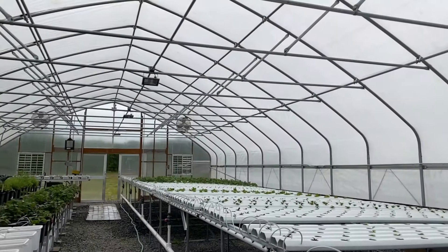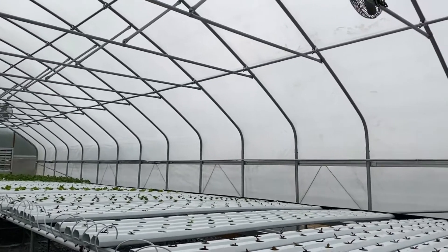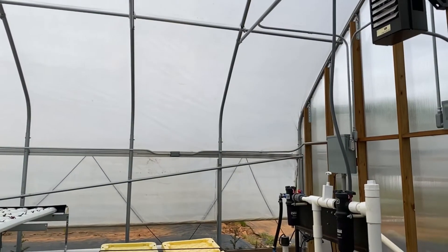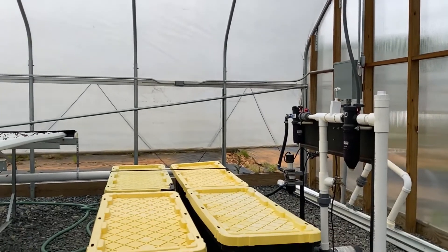This video will go over how to take water quality parameters in a hydroponic system. At Firebird Farm, our nutrient film technique system is located in one of our greenhouses.